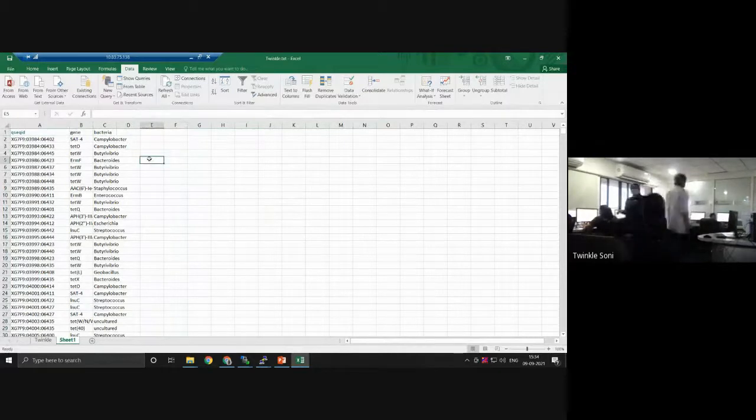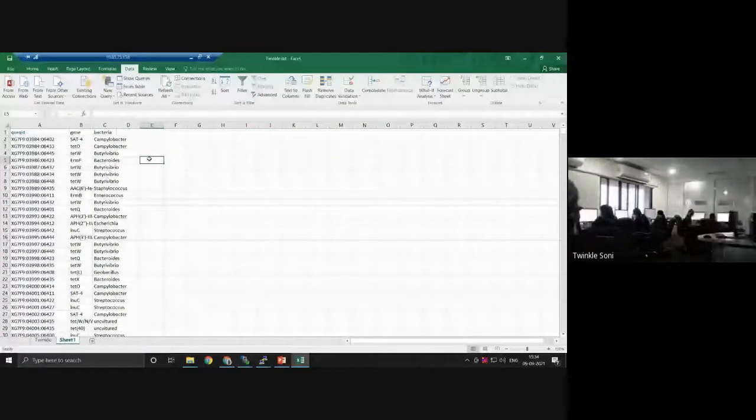Okay. So now it was general Excel. Now what we will be doing is pivoting. What exactly will pivoting be doing? See, you can see tetracycline W over here, tetracycline W over here and here as well. There are a lot of entries of tetracycline W, even other genes as well.